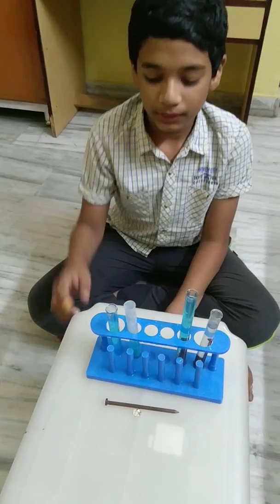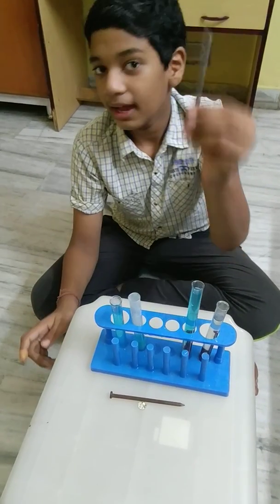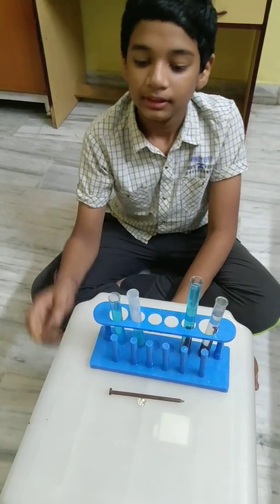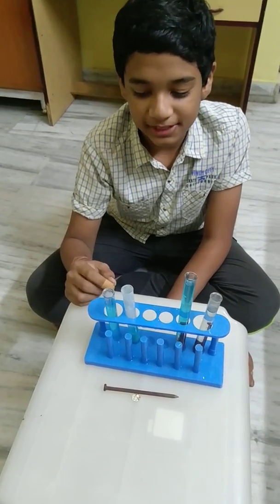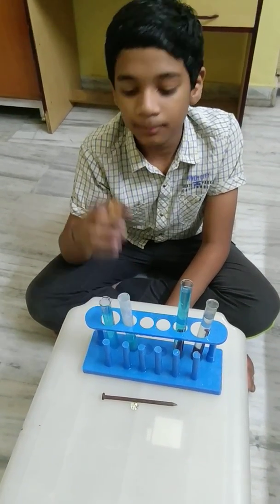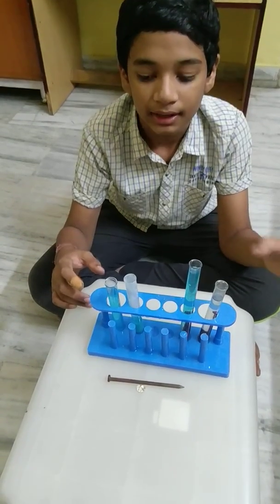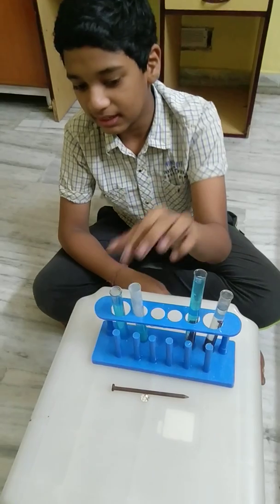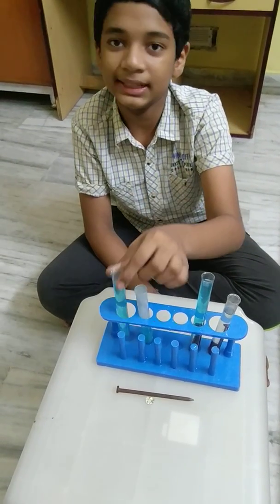Today, let's do an experiment to coat copper on the iron nail. This reaction is known as a displacement reaction, where a more reactive metal displaces a less reactive metal, and therefore in this case copper coats iron. So, let's get started.